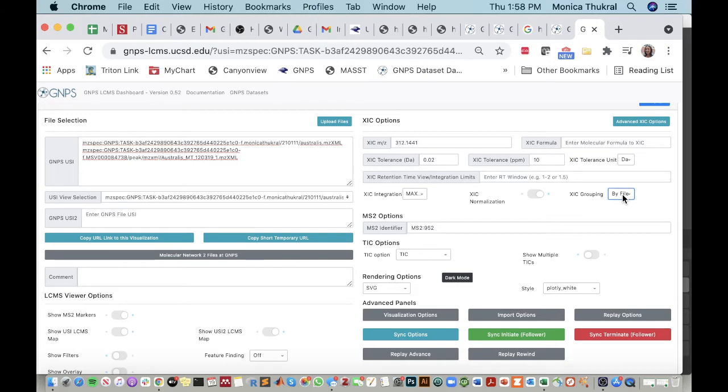Due to the use of different platforms for data analysis, we expect the absolute value of the intensity of the peaks to differ. To resolve this problem and ensure proper comparison, the XIC normalization toggle feature here is turned on to clearly and easily compare visual data.